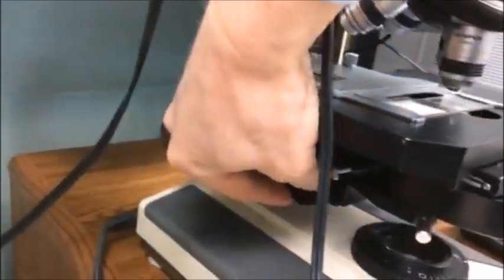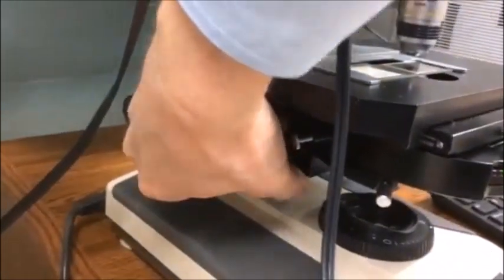So watch what happens as I turn the condenser focusing knob, which is not the specimen focusing knob, but the condenser focusing knob. If I turn it so that it moves the condenser down away from the stage, this is what it looks like. And you'll notice if I turn it too far, then the brightness in the middle starts to get spread out again. So I'm going to crank it back up again. It gets narrower, and then it starts getting bigger again.